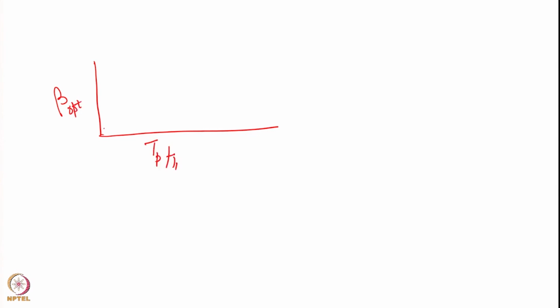Notice that when I plot this curve, every point on this curve gives the maximum signal. So, if my T1 is very large compared to Tp, what should I do? This one is 90 degrees, and all other ones are lower than that.